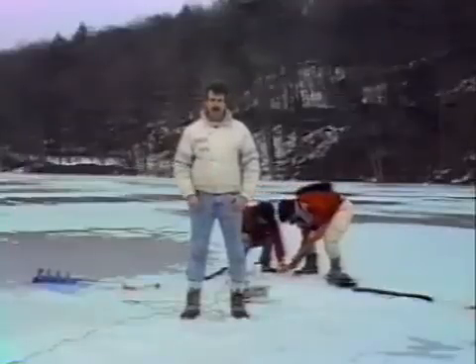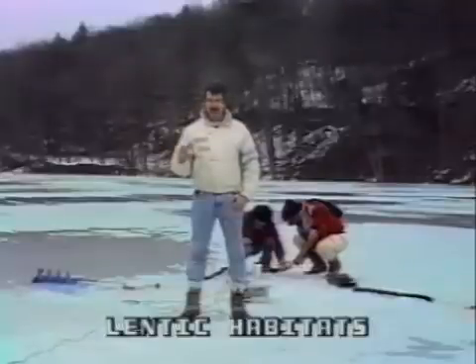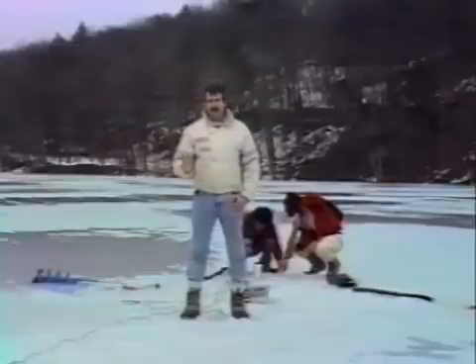When you're trying to determine primary production in Lentic habitats — that is, lakes — one of the best techniques to use, as we're using today on Binney Water, is the light and dark bottle method.